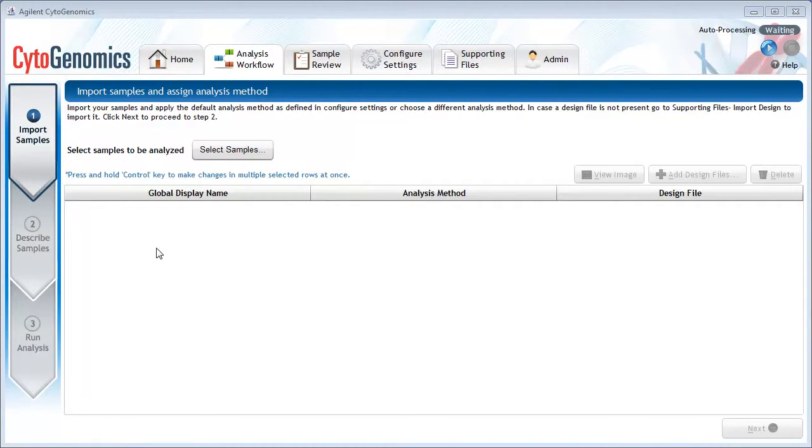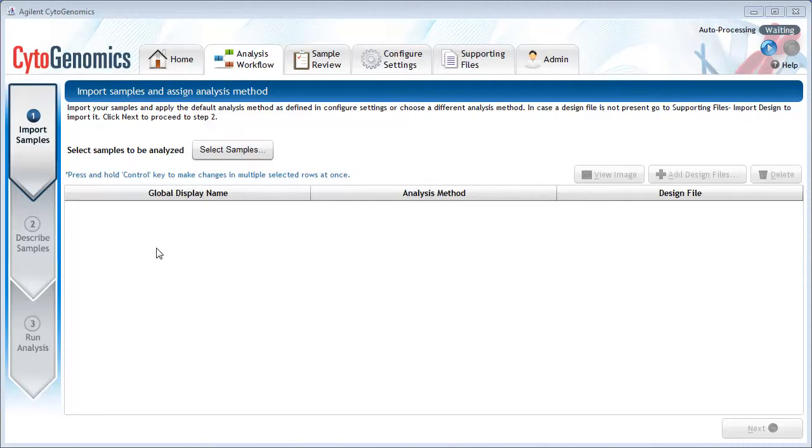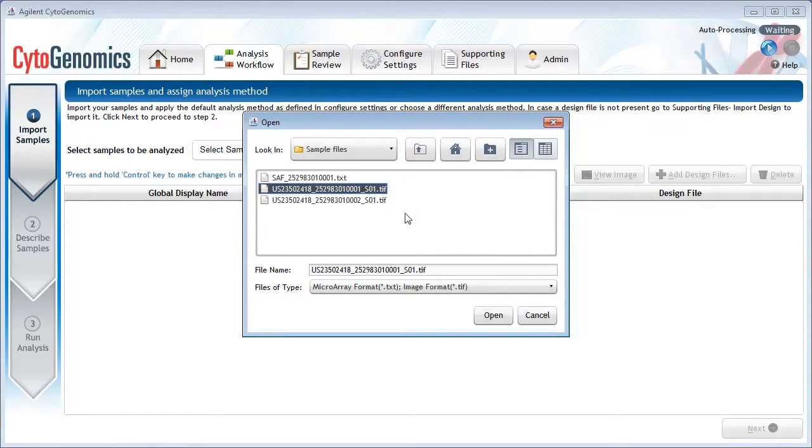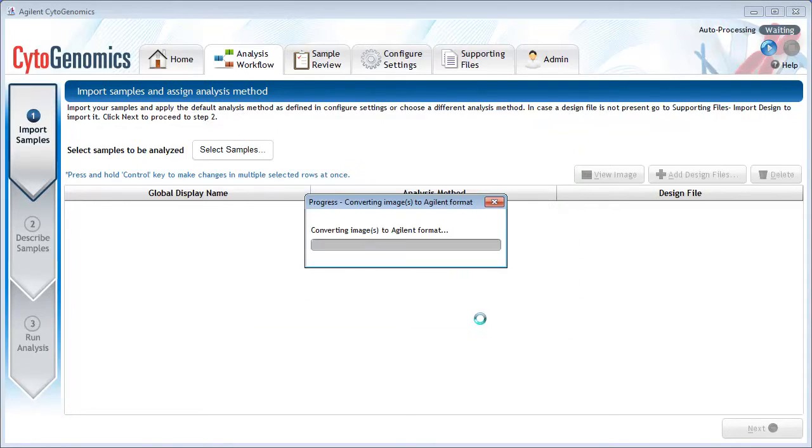The first step is to import the samples. The sample files can be TIFF images from the microarray scanner or feature extracted text files. Click Select Samples and browse to the folder that contains your sample file. I'm going to select this TIFF image and click Open.